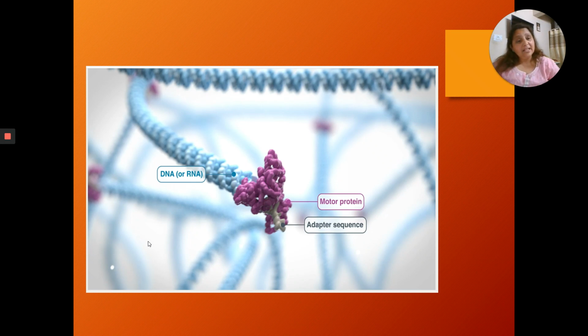अब फ्लो सेल में क्या है? सीक्वेंसर के फ्लो सेल में वह मेम्ब्रेन है जिसमें लॉट्स ऑफ नैनोपोर हैं. आप assume कीजिए कि आपने ऊपर से डीएनए छोड़ दिया है और अब वह डीएनए 3 dimension में उस फ्लो सेल और उस मेम्ब्रेन के ऊपर फ्लोट कर रहा है.